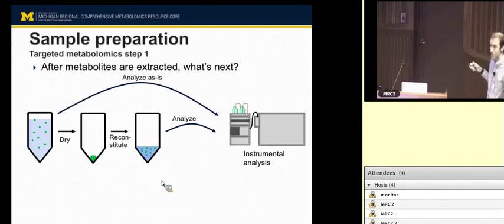But a very useful feature of metabolites and all biological molecules, and every molecule for that matter, is everything has a mass. And a lot of the times, the masses tend to be fairly unique. In the case of carnitines, we can see the individual masses for all these different types of carnitines. That's actually a misprint there. That's incorrect. Sorry, that should not be 204. Although we do sometimes see things which have the same mass. C2 carnitine and C4 carnitine actually do have different masses.